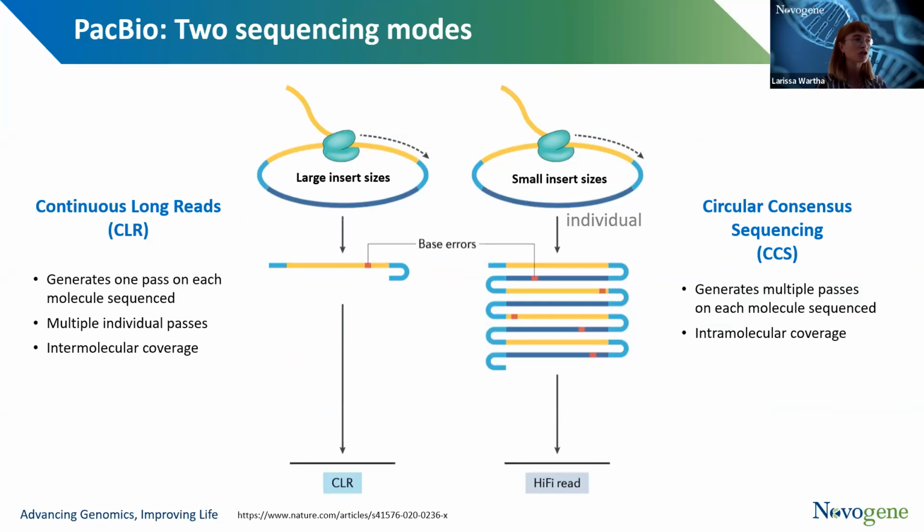So you just use these longer reads to be able to assemble a genome better. That is where you can use that approach. However, if you want to completely sequence a new genome just by using PacBio and you want to look at structural variations and other aspects, I would always recommend the circular consensus sequencing mode.